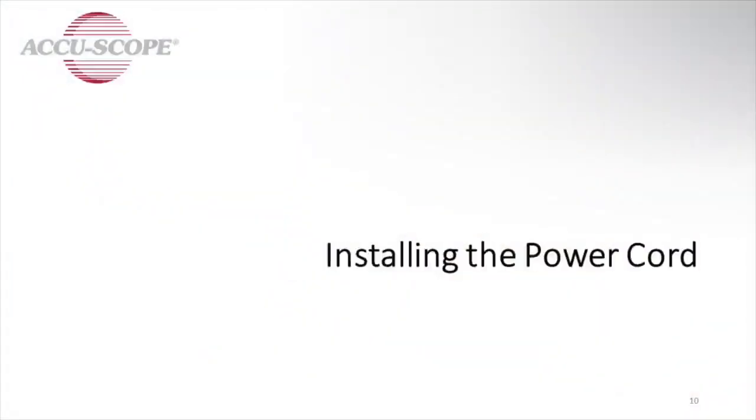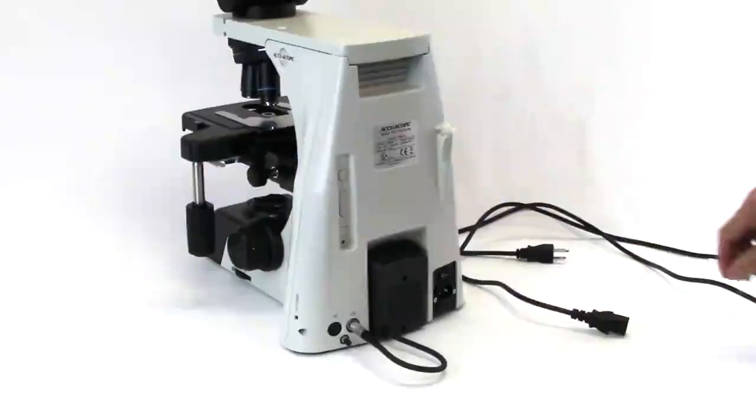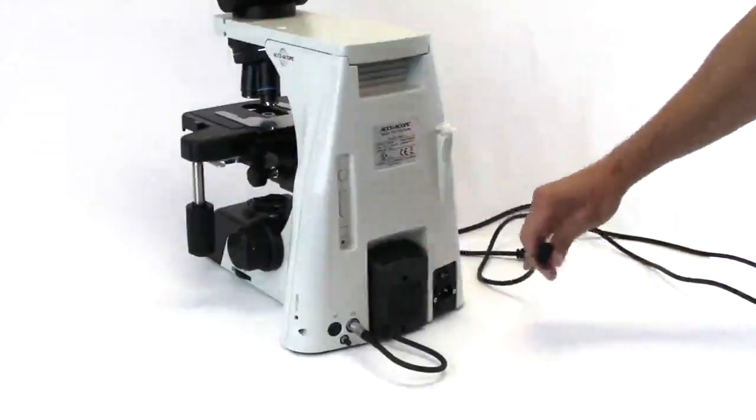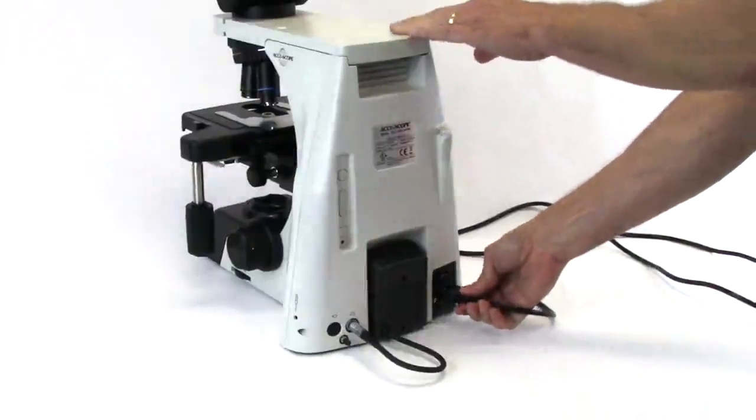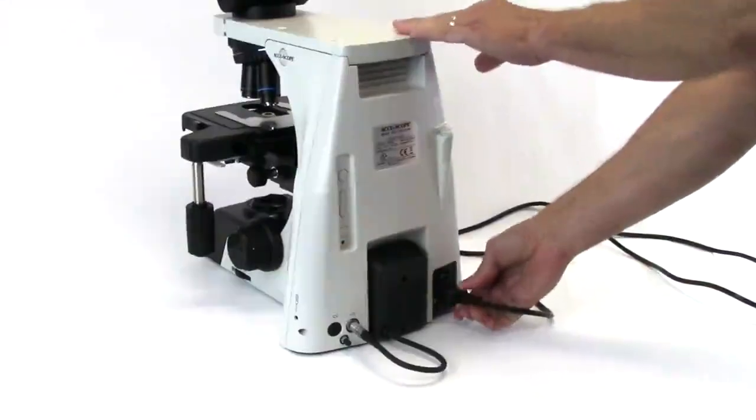Installing the power cord. Align and plug the female end of the power cord into the power cord socket on the back of the microscope. Plug the other end into a grounded three-prong outlet.